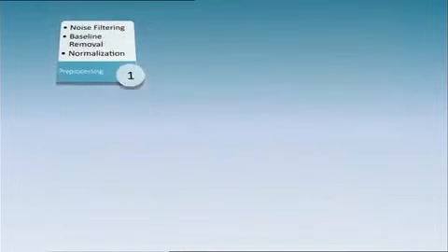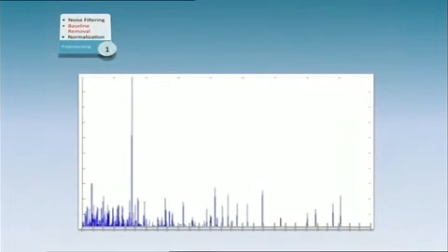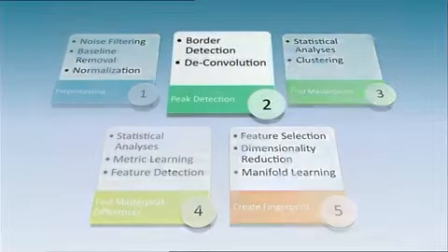The process starts with the raw data coming from the mass spectrometer. Initially, this data is denoised to facilitate subsequent steps of the analysis. Following this, the so-called baseline is detected and removed. Afterwards, the spectrum is normalized to establish a common level, so it can be compared to other spectra. Now the actual detection is performed, which identifies the so-called peaks.